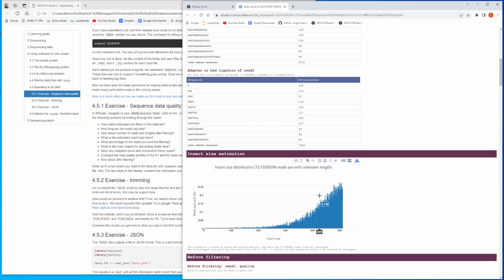So from such reads, we can actually see that the fragment or the insert size, that's the fragment length, right? Is 500 bases. But for the fragments who are longer than 600 bases or 550, because you need certain overlap in order to be sure of this, you don't see an overlap if it's too short, right?